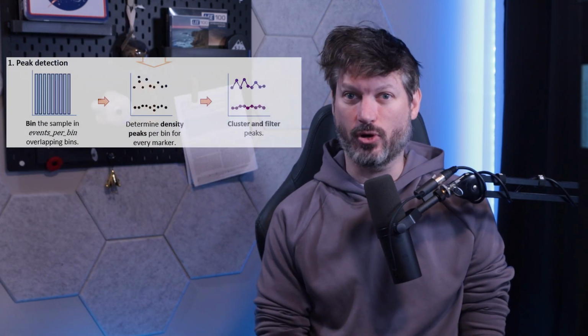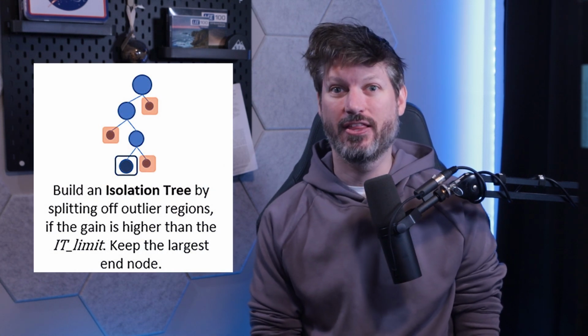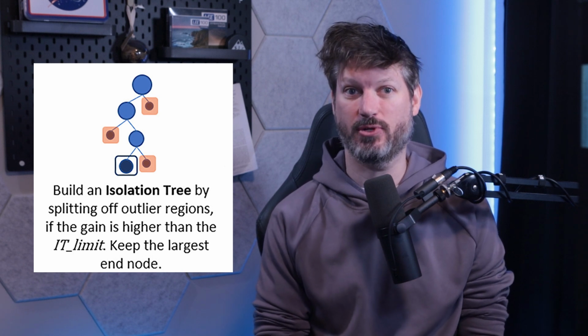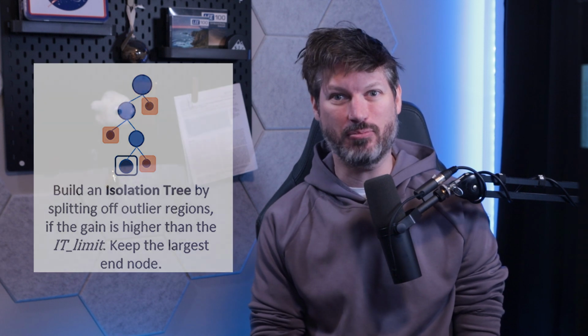It uses a clever approach based on density peaks within your data. Once those peaks are isolated, the cleaning strategy begins with two main filtering approaches. The first is an isolation tree. Imagine building a decision tree that tries to isolate individual data points based on their peak values. PeacoQC uses a special kind of tree called an isolation tree. It effectively identifies bins with aberrant peak values that are easily separated from the rest of your data. This is particularly useful for catching those sudden shifts or unusual patterns that might affect multiple markers simultaneously.